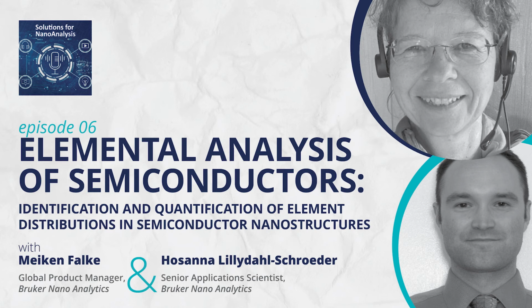All right. From what you're saying, it sounds like EDS is a very mature technique and well suited for identifying many different elements in the semiconductor industry. Are there any particular examples where EDS has provided answers to particularly challenging topics, or do any other interesting applications stand out to you?